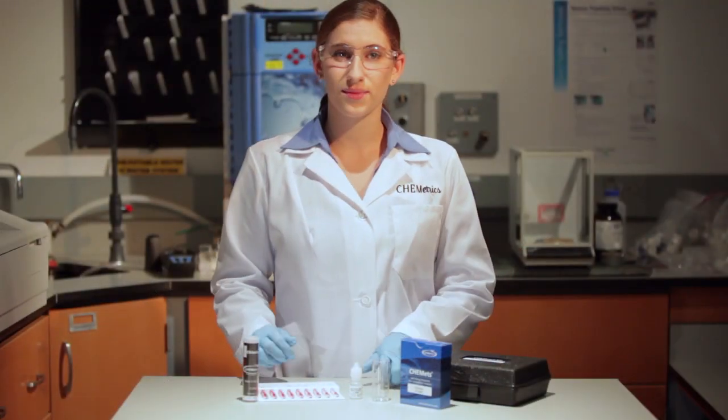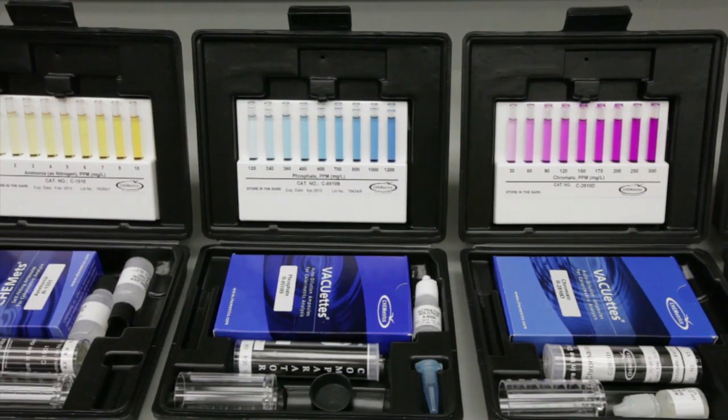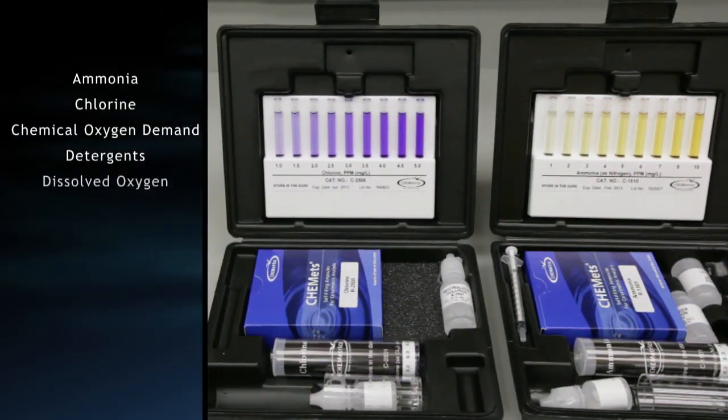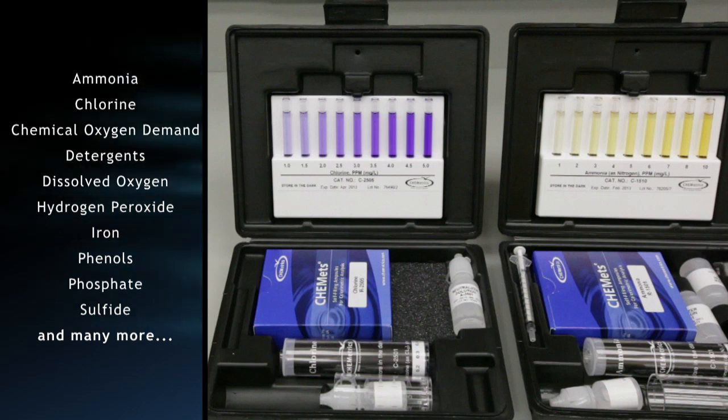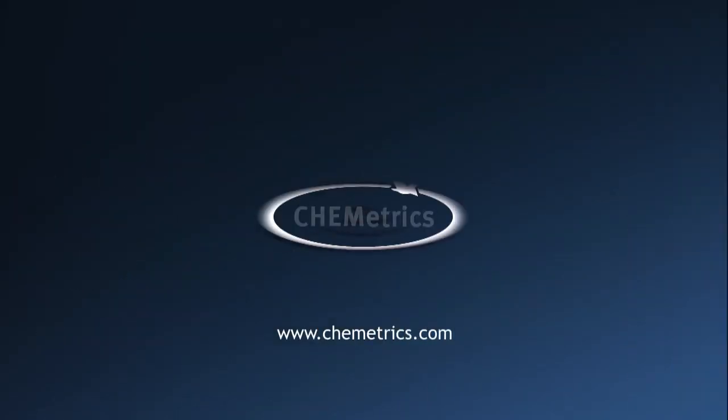Designed for field and lab use, most test kits come with everything needed to perform 30 tests. Reagent ampules and kit accessories are also sold separately. Visit our website at www.chemetrics.com to order your test kit or refill today.